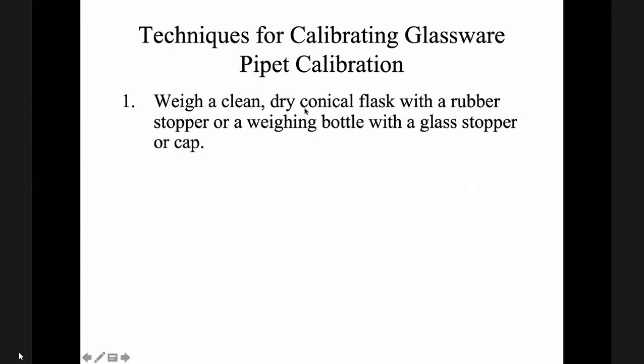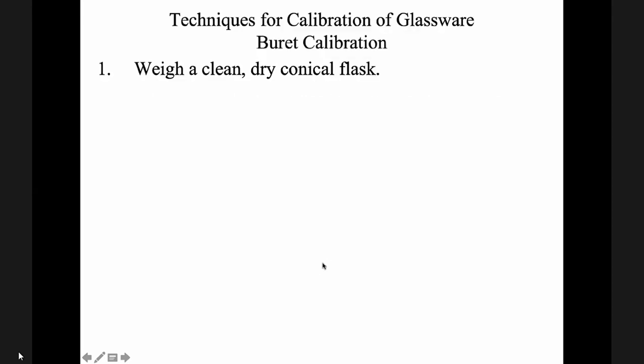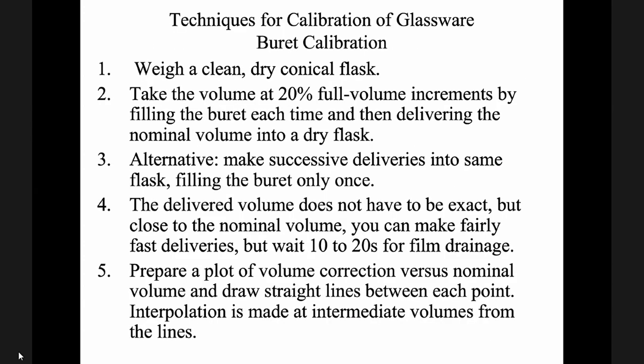Okay. Now, tips for calibrating glasswares and also pipette. Weigh a clean, dry conical flask with a rubber stopper or a weighing bottle with a glass stopper or cap. Next, fill the pipette with distilled water. Ato bala kaginang na-discuss na. Okay. So, ang highlights na lang. Same also with the burette.